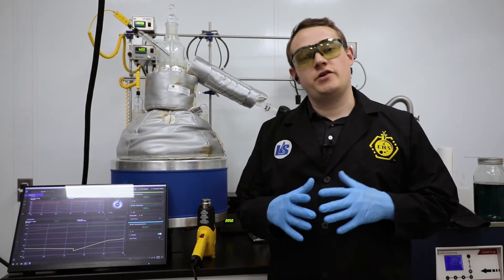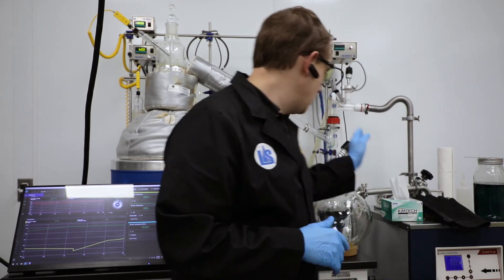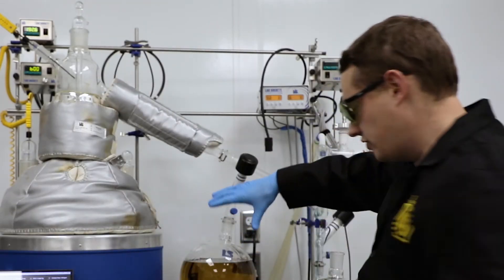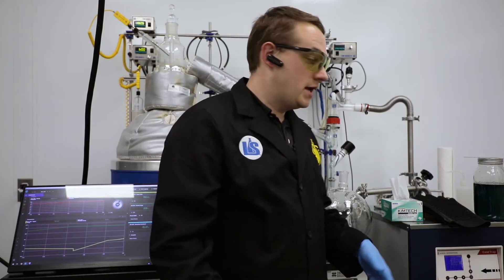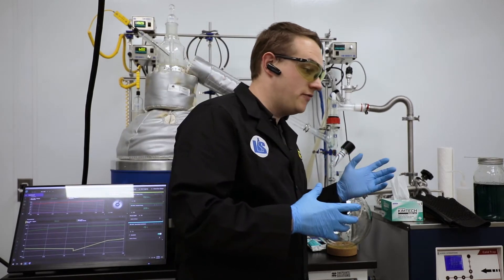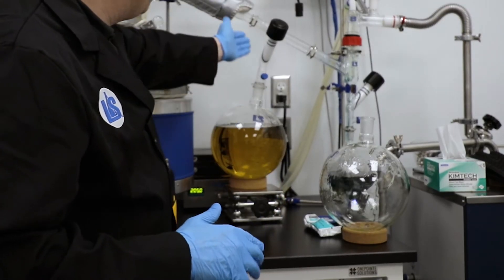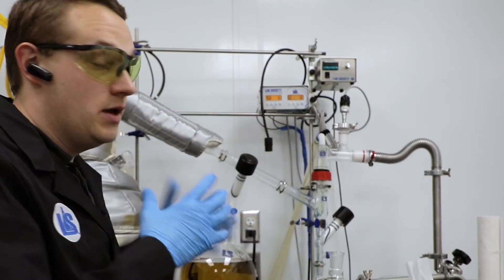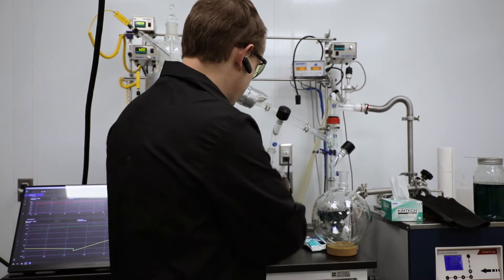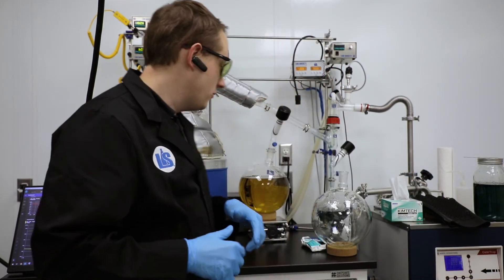So we went over how to add a flask to the system and change our secondary receiver. But now we're going to look at how to change a flask that's relatively full on the system while collecting in real time. We obviously want to be careful of spilling any of this precious product. We're going to be collecting while we're actually swapping the flask, so we've got to be pretty quick about this — and obviously we don't want to make a big mess or break anything. There's a lot of things to think about when changing a flask mid-run.